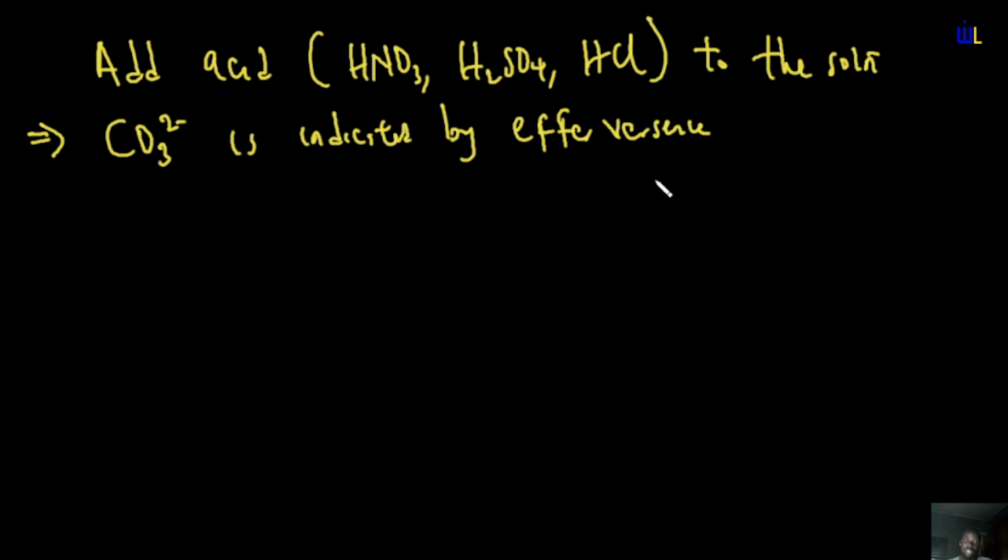That's what we refer to as effervescence. So once you have CO3 2- and you add an acid, you will notice effervescence, giving a colorless, odorless gas.